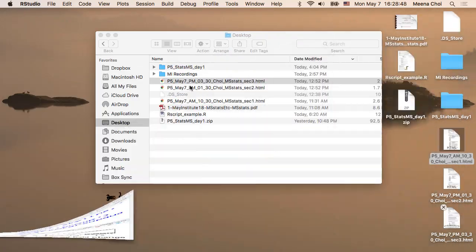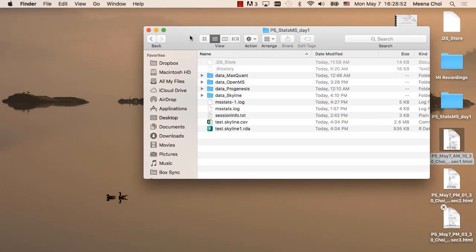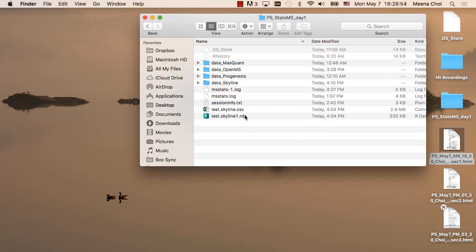Then last, what I want to address, we tried multiple things, and then there's a folder. I want to introduce two types of files. We never made these automatically. They were generated. One is a session info.